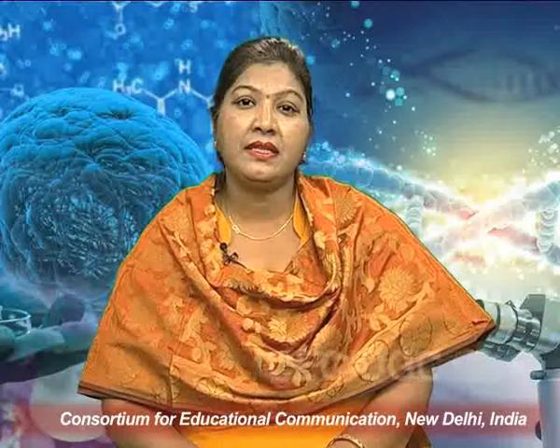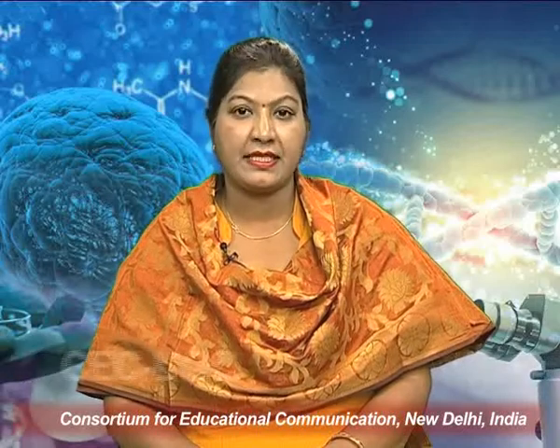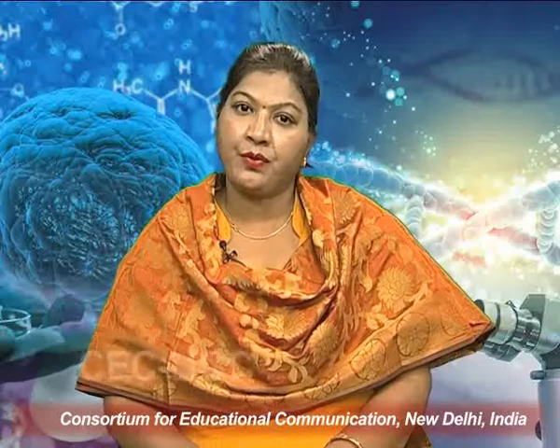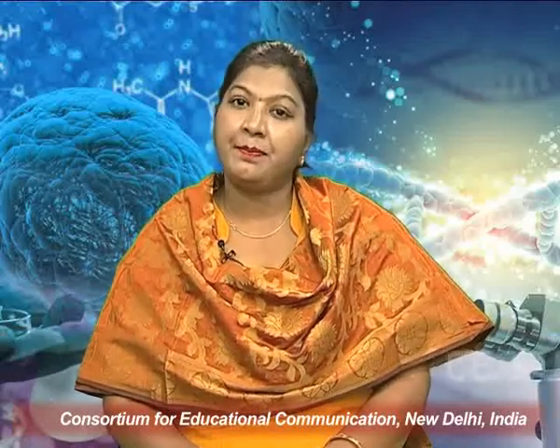We are dealing with scanning probe microscopy, where we use a probe to scan the surface. This is a family of microscopy forms where a sharp probe is scanned across the surface and some tip and sample interactions are monitored through the display unit. Means in scanning probe microscopy we use the probe to scan the surface and there is an interaction between the tip and the sample.